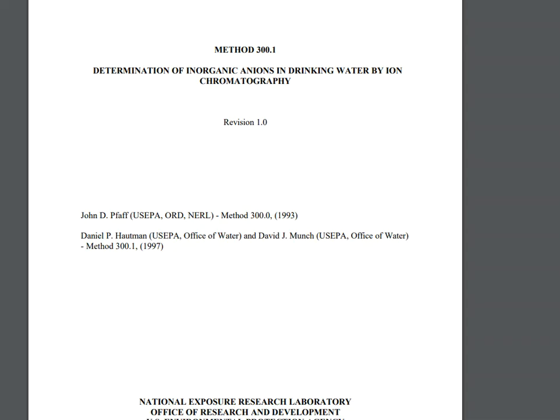Guys, if you've taken our quality control class, CTC 115, then you've seen this method before. It's method 300.1. This is how we kind of ended that semester. But if you've not taken that class, don't sweat it, because we're not going to be talking about the method as a whole. We're just going to be looking at a piece of the method that relates to the calibration curve. So I'm pulling up method 300.1.